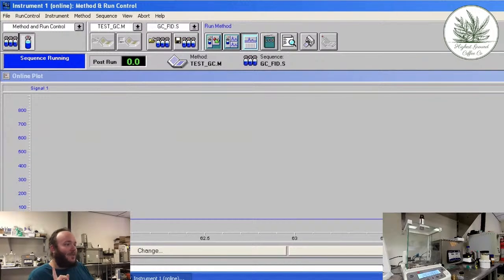All right, so if you didn't catch it, what I was just talking about, the samples didn't finish running yesterday, so I'm gonna have it run now. We'll finish it and then we'll tabulate. We will show the tabulation process. So while that's running, since that's going to take a while, I'm going to play around with the camera setup and see what we can do to have a little bit more interesting shots, I guess. So let's do.